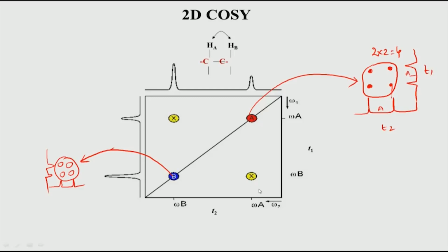Okay. So, you see this is marked as X because it is a cross peak. So, cross is X. So, we use the word cross peak. Sometimes in literature or in textbooks, we also use the word off diagonal. This is diagonal and this is off diagonal. So, keep this in mind. The third nomenclature which is used in literature is called transpose peak. So, if this is a peak, the transpose of this peak is here. Similarly, the transpose of this peak is here, similar to what we use in matrix algebra nomenclature. So, these are the different terminologies which you will come across in the books as well as when I am talking about this. So, this is a diagonal peak and this is the cross peak.